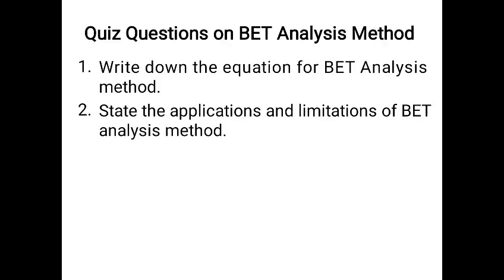Quiz questions on BET analysis method. Write down the equation for BET analysis method. State the applications and limitations of BET analysis method.